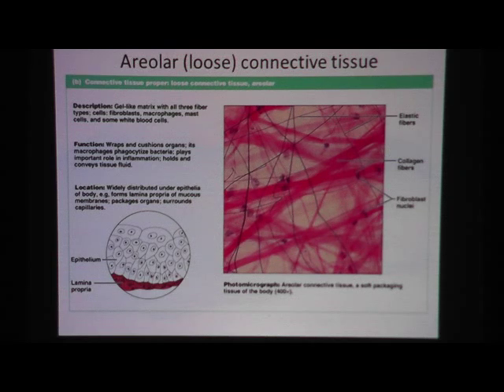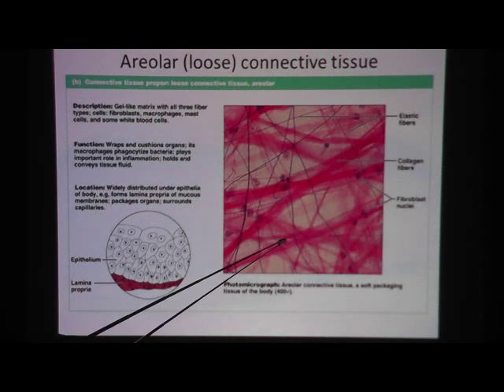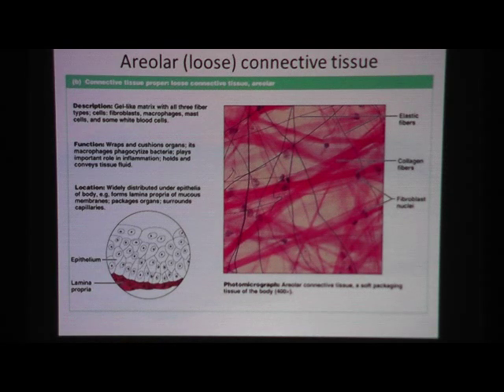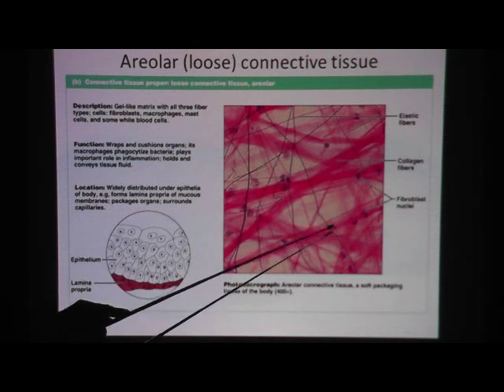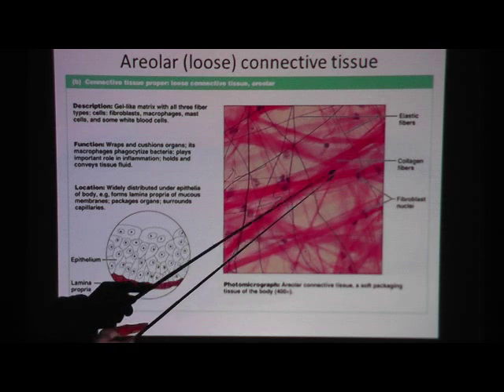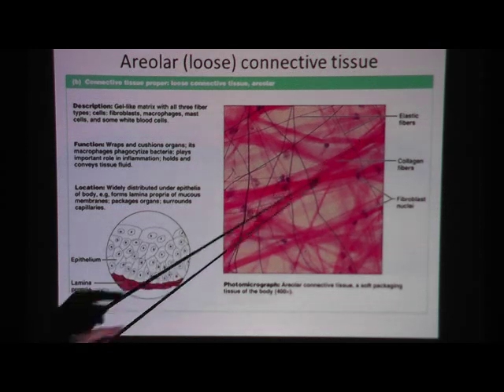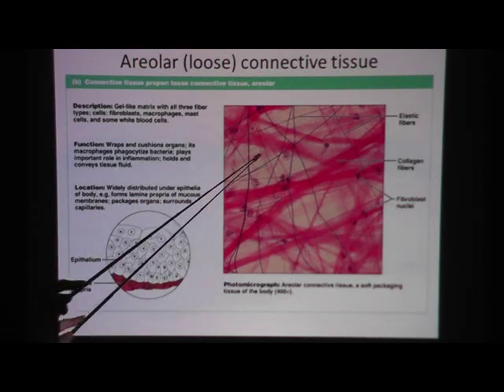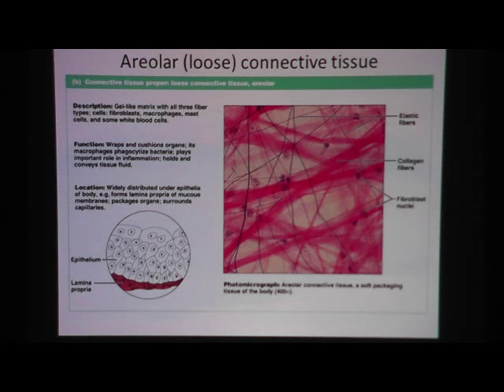Let's talk about areolar loose connective tissue. The main cells you need to know here are fibroblasts. You can see the cell because of its nucleus — when you see the nucleus, you know that's a cell. The most common cells in areolar tissue are fibroblasts. Notice how the cells are scattered with lots of space in between. In that space you have fibers: the thick fibers are collagen fibers, and the thin, skinny fibers are elastic fibers.